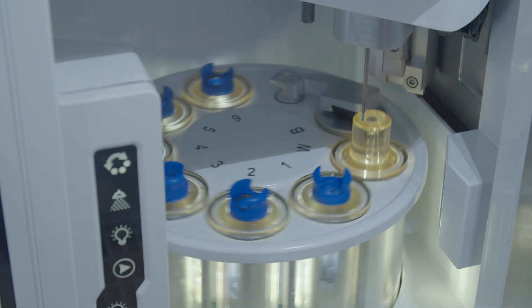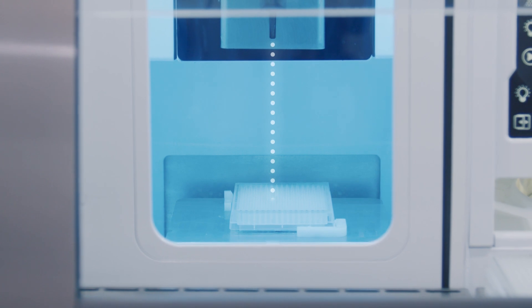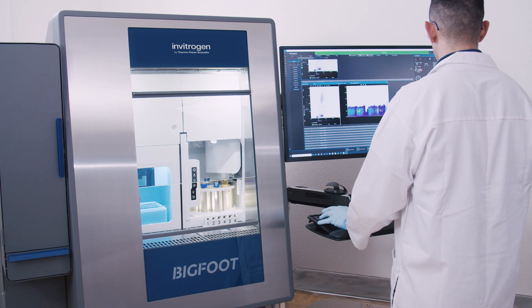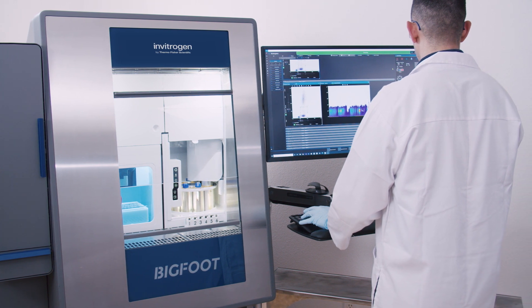The spectral unmixing process is performed with specialized state-of-the-art hardware allowing for remarkably fast real-time processing and high purity spectral sorting.